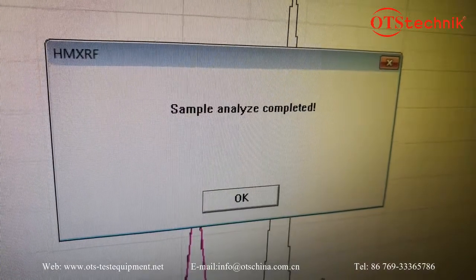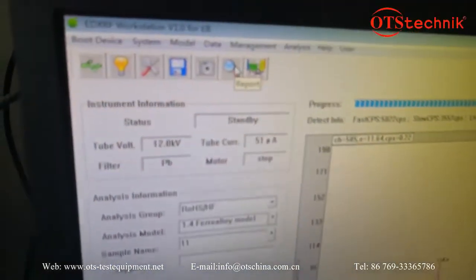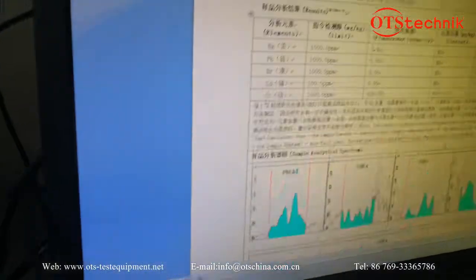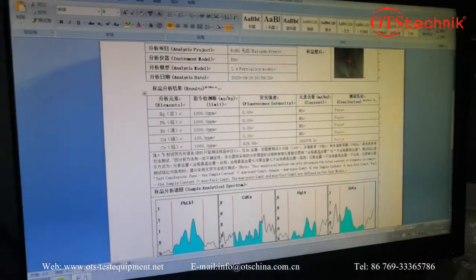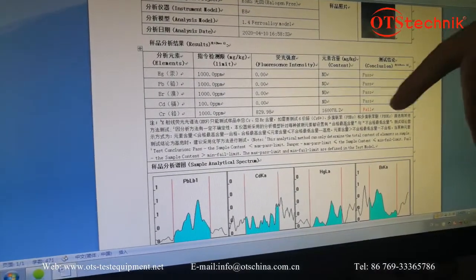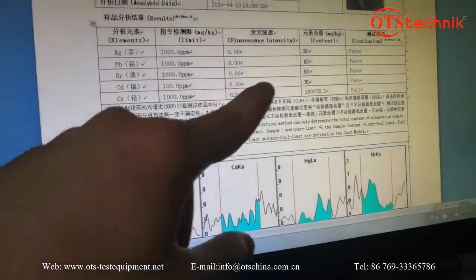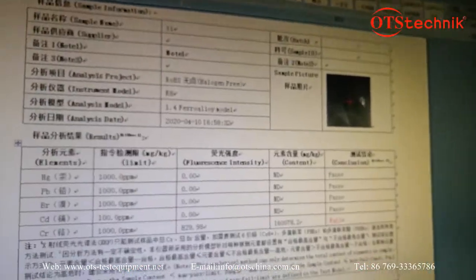Sample analysis is now complete. We check the report — generate the report. This is the report. For the stainless steel sample, the Cr value is low and did not pass. The sample is stainless steel. This is the picture of the sample.